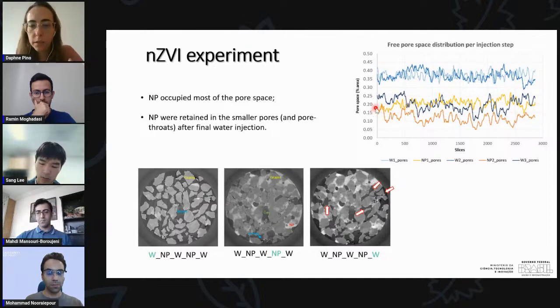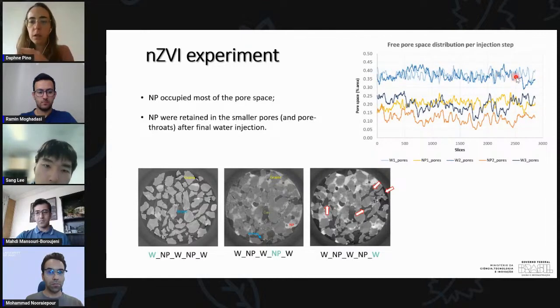So we lowered our porosity to between 15 and 20% through our sample. This is kind of what we were expecting, and we're happy because the nanoparticles were actually filling the pores. That's what you want when injecting in the field to react with a contaminant. Then we injected water again to wash away those nanoparticles, and we succeeded because this is what you see here in this medium blue. We basically recovered all our porosity, so we were able to wash most of those nanoparticles away.